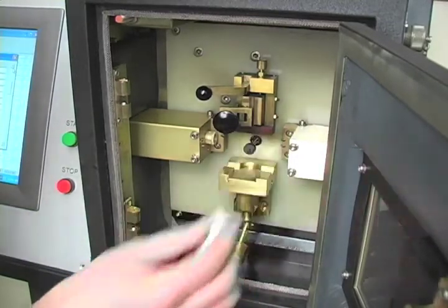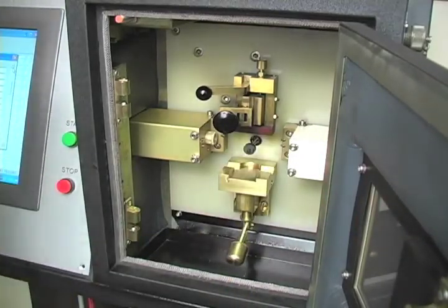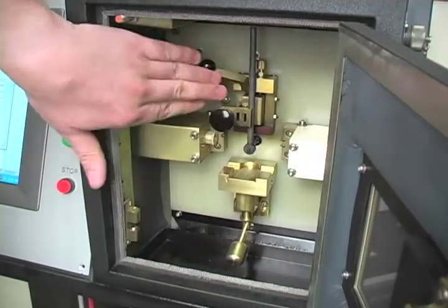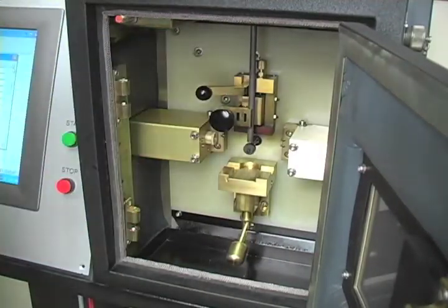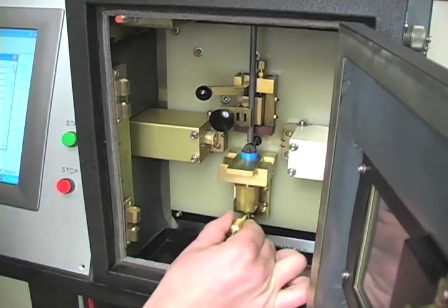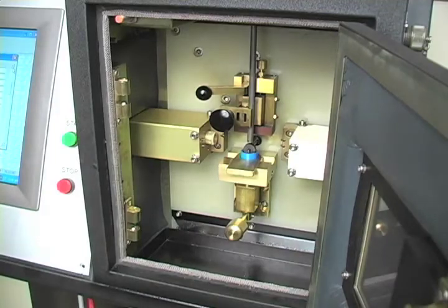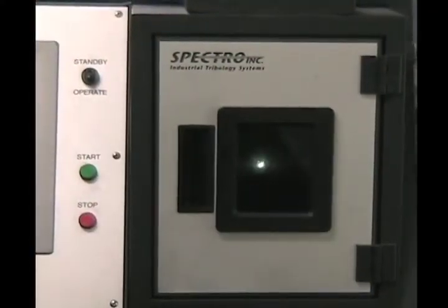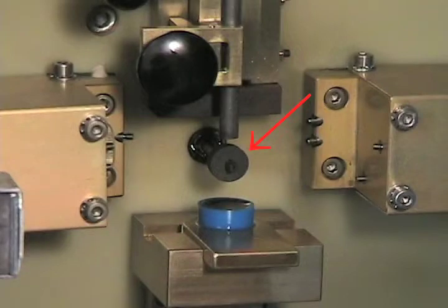To run a test, the rod and disc are placed in the sample stand, and the gap is set. A sample of 2 milliliters that requires no preparation is placed on the table, which is then raised so the disc electrode located on the shaft is partially immersed in the sample. Once the start button is pressed, the disc electrode rotates on the shaft and carries the sample into a gap formed by the two electrodes.